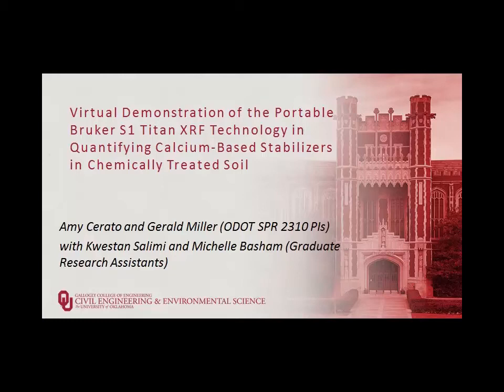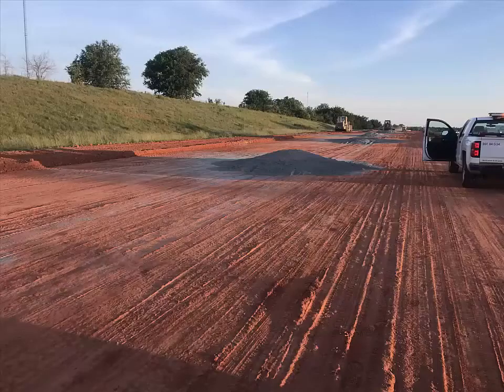Welcome to our demonstration of the portable Bruker S1 Titan XRF technology in quantifying calcium-based stabilizers in chemically treated soils.